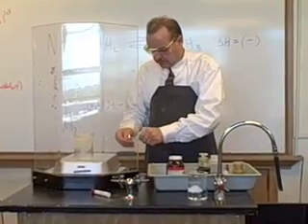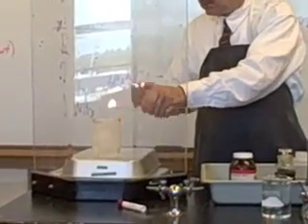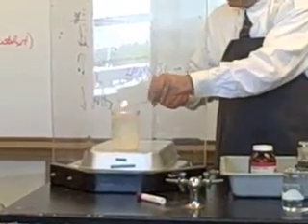I'm lighting a little fire here on top, but watch what happens to the bubbles. Boom! The bubbles are a flammable gas.